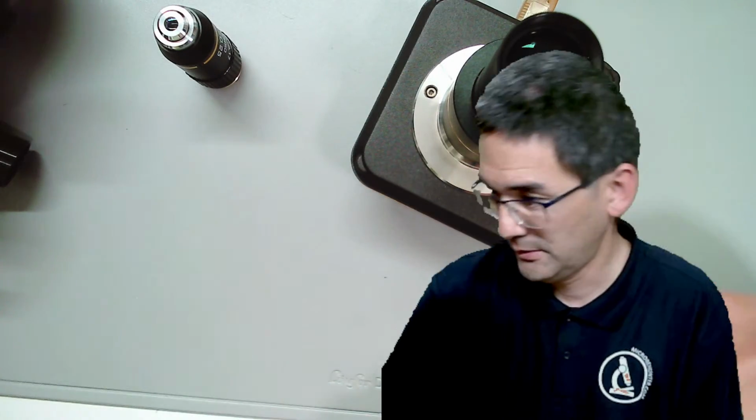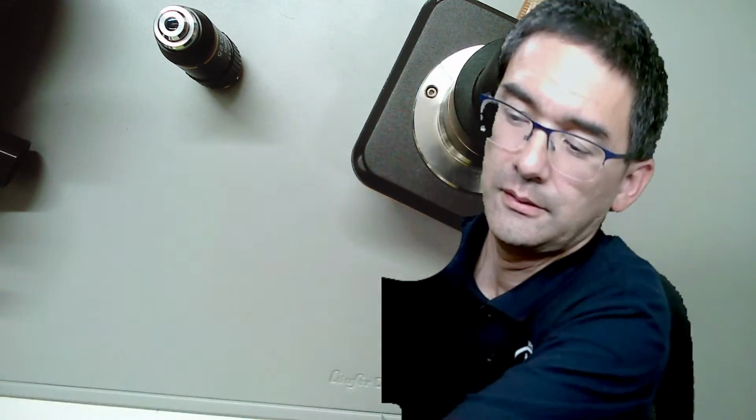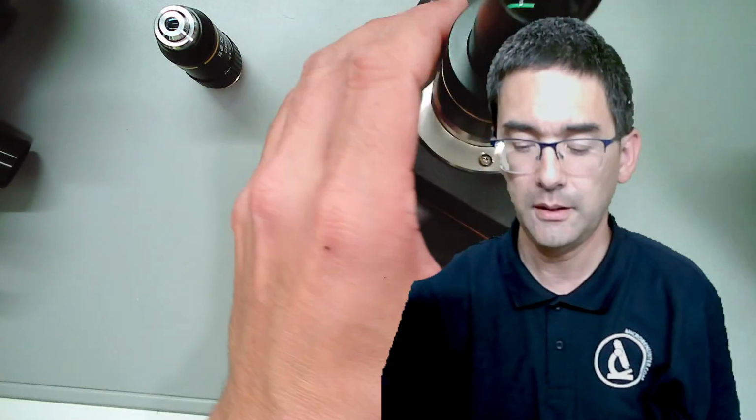And now let's insert the slide. Just a second. I'm switching over to the camera right now. So it might take a second or so to turn on. At least I hope that it does that without any problems, because sometimes the camera switches off. Ah, here we go. Does it do that or does it not? Yeah, sometimes it switches off. I'll try it again. Otherwise, you get the idea.